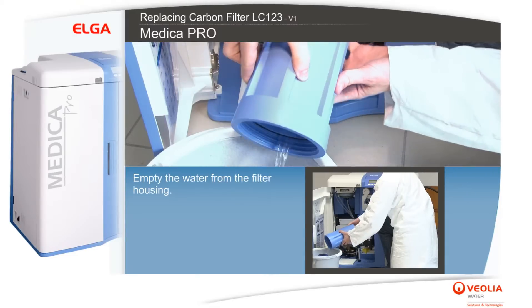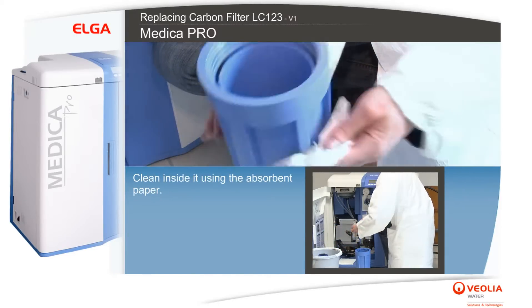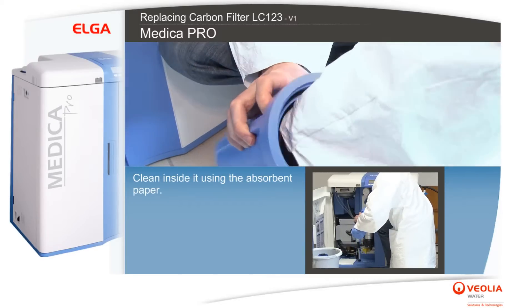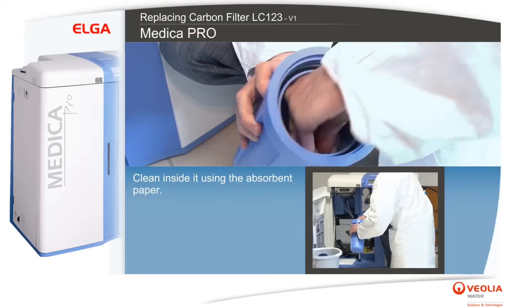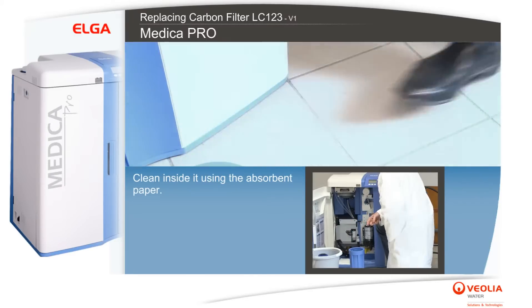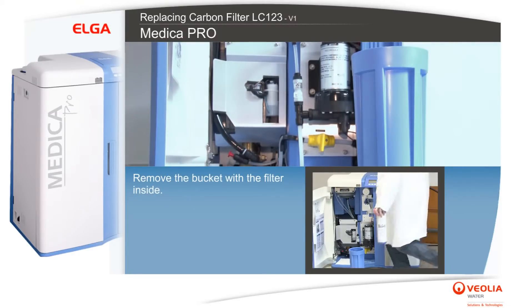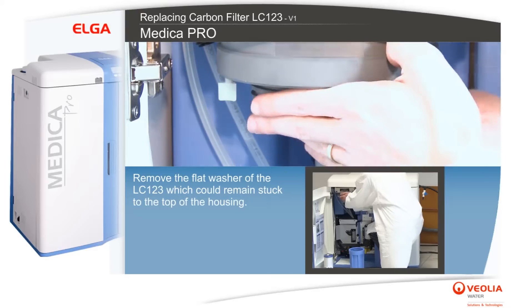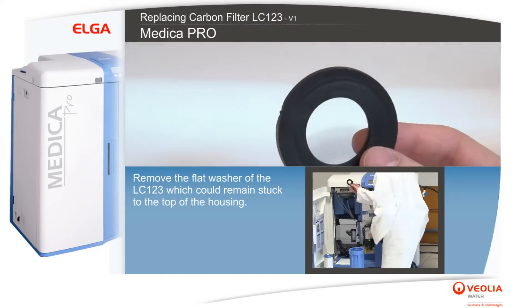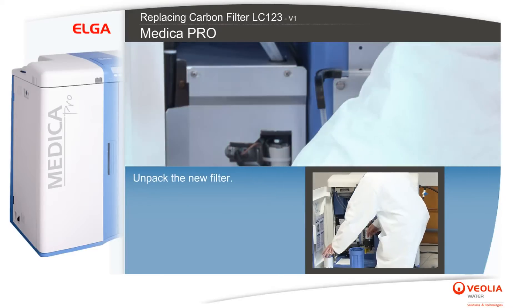Clean inside the filter housing using the absorbent paper, then remove the bucket with the filter inside. Remove the flat washer of the LC123, which could remain stuck to the top of the housing. Unpack the new filter.